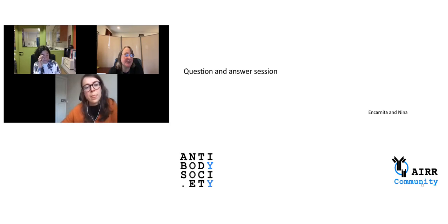The challenge that we encounter is that the sequencing depth you need for the UMIs to be useful is very difficult. If you're using this for a bulk sequencing library, we find that we get more bang for our buck if we use copy number filtering and other methods rather than UMIs, because the depth of sequencing that we need for the UMIs to be workable, if we're analyzing thousands of clones, for example, becomes very, very expensive. So that's one challenge.